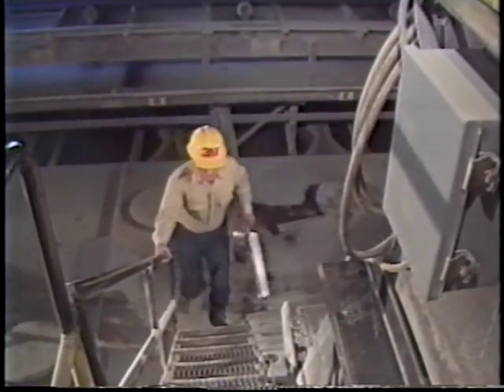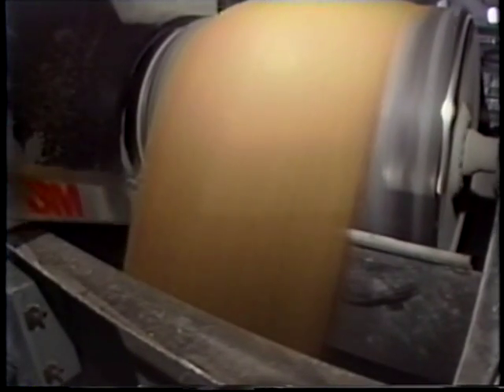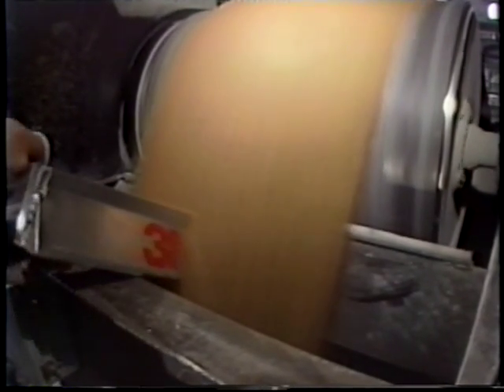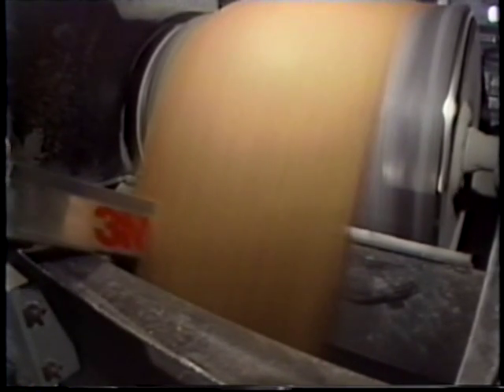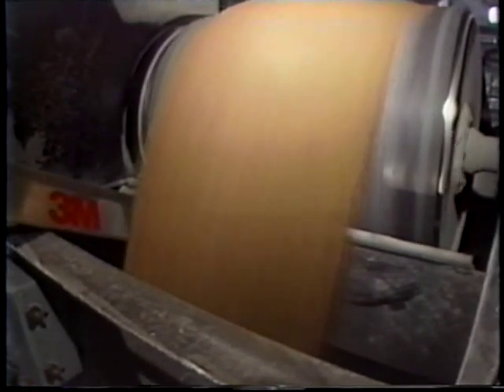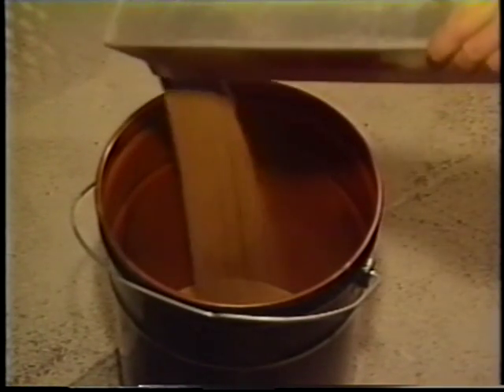Select the location to take your sample where the granules are falling freely in an unobstructed stream. The number of sampling cuts you should take depends on the size of the shipment you're checking. The greater the tonnage, the more cuts you need to take for a representative sample.